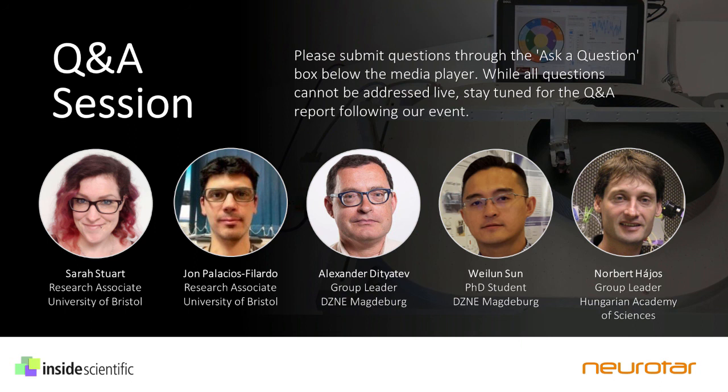All right, thanks, Wei-Lun. And so the next question would be for you, Norbert. How long do you wait after insertion of a silicon probe into the amygdala region before the recording? And what is the stability of units on an acutely inserted probe?